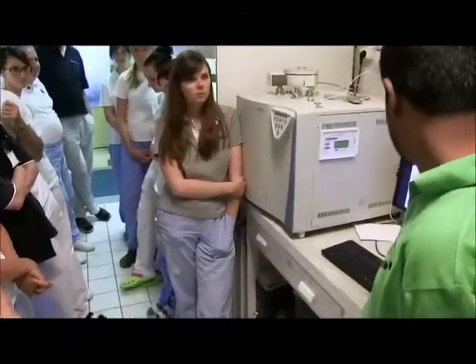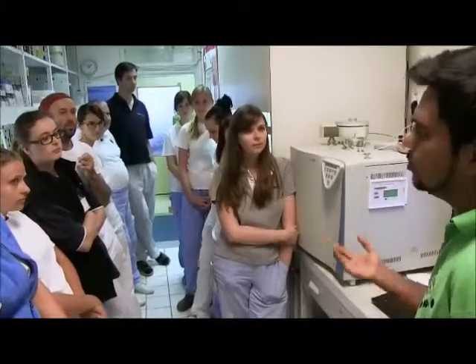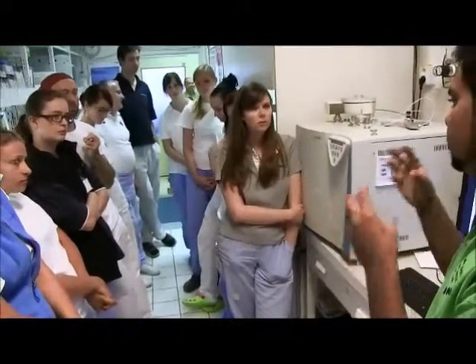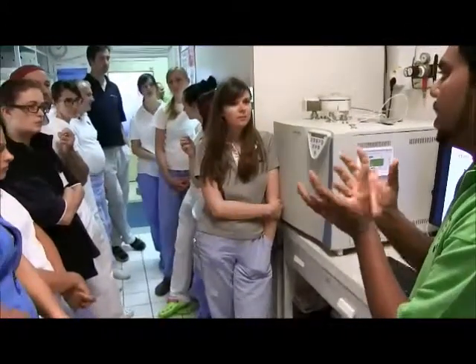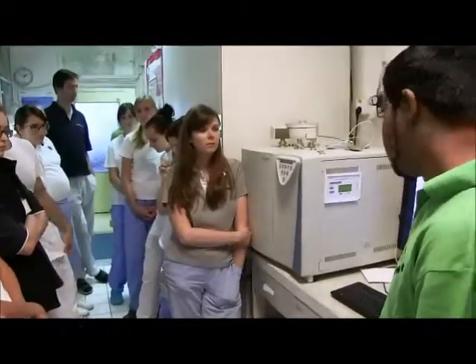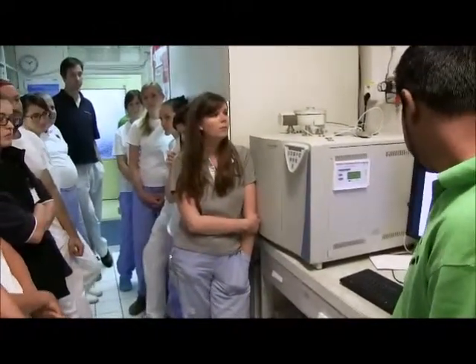Also, if we prepare green quantum dots and keep them for 1 month in our laboratory, we found that they can turn red after 1 or 2 months, because in the solution the quantum dots accumulate and get together and make bigger particles, which really changes the fluorescence. So it is always recommended to use fresh samples to have really good quality.